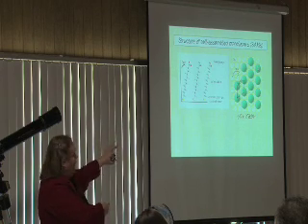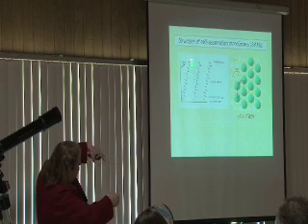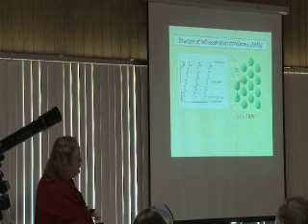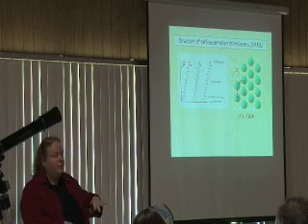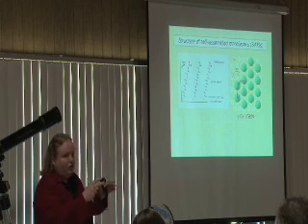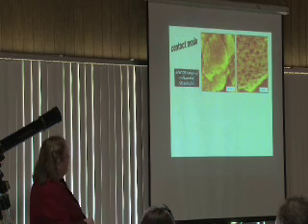If you were looking at the top, now we're not going to look at the side view. We're going to look at the top view of what these molecules look like when they arrange on a surface. The surface is going to have some bumpiness to it already, and you can only see a circle where the methyl group is. And this is what it looks like.